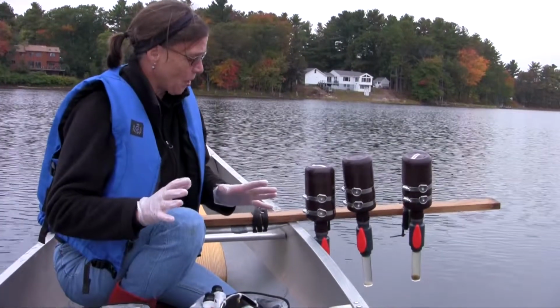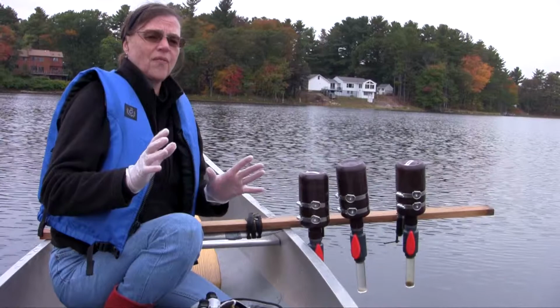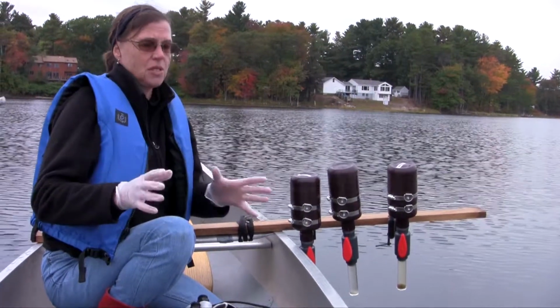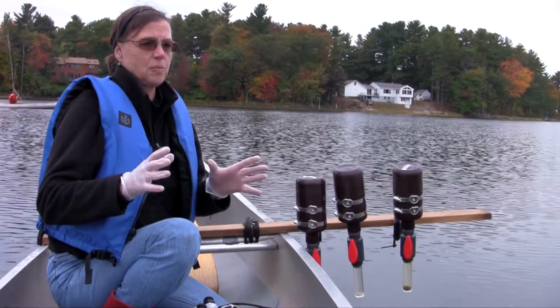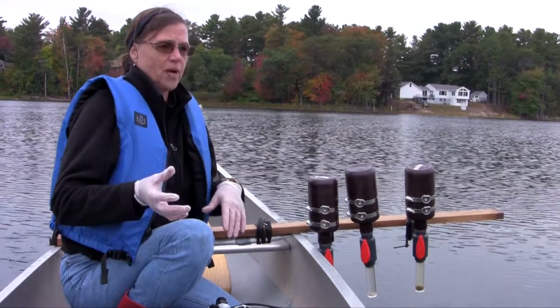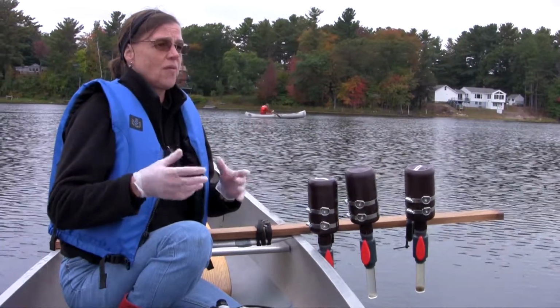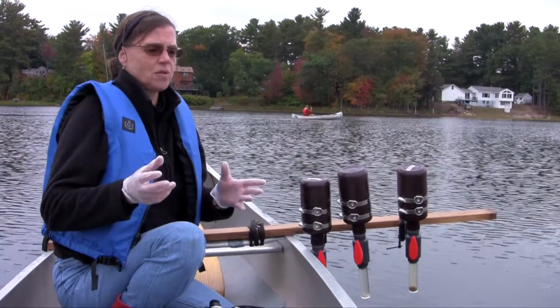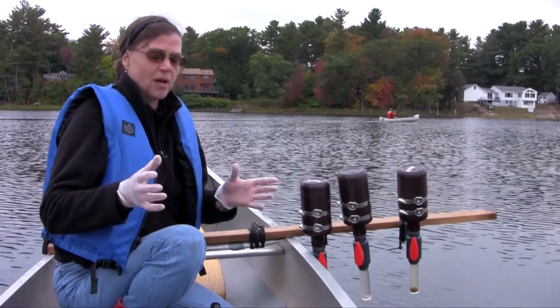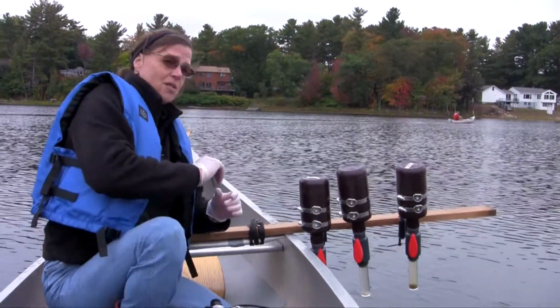So we're going to stop the process, and we're going to put the samples through different filter cones that we've developed that make it much easier to be able to transport these samples from the field back to the lab. We also provide for drying the samples in the field so that we don't have any kind of extra bacterial contamination and things like that. So we have come up with field drying chambers and desiccators that we're using. So let's take a look at how these filter cones work.